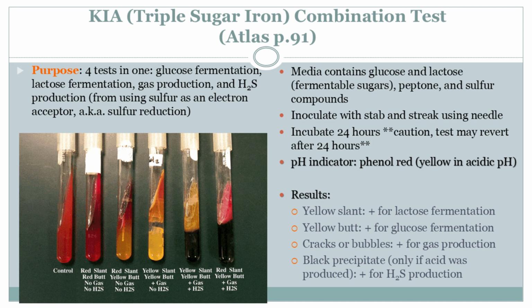So we've got our bacteria happily settled in their agar buffet. Indicator chemicals are in place. What's next in this bacterial stakeout? Now we play the waiting game. We incubate the agar slant, usually for about 24 hours, at just the right temperature that those bacteria love. It's like tucking them in for a nice cozy nap.